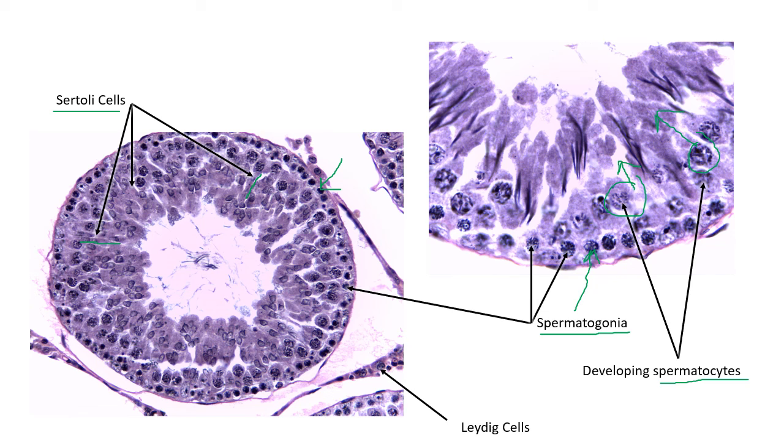And then, of course, we can see Leydig cells outside of the seminiferous tubules. So it's pretty neat to see all the different components of those seminiferous tubules in the testicle.